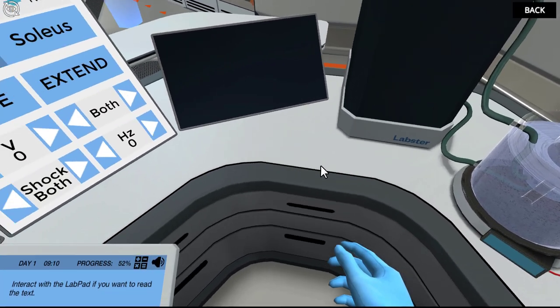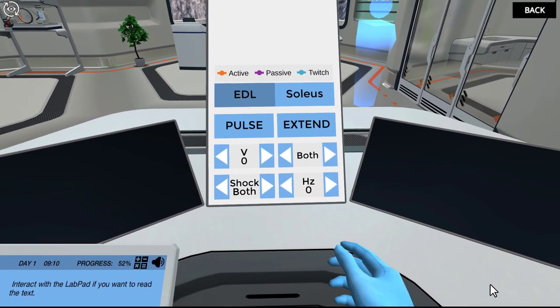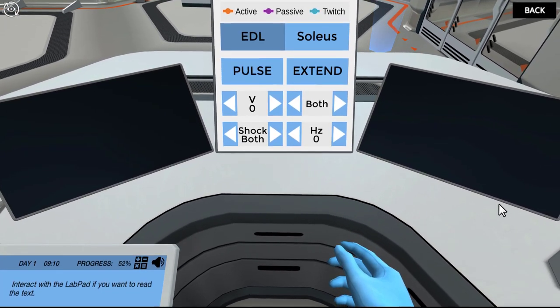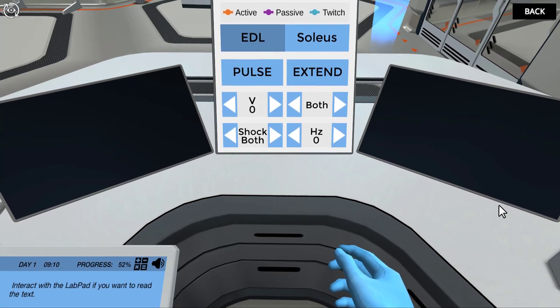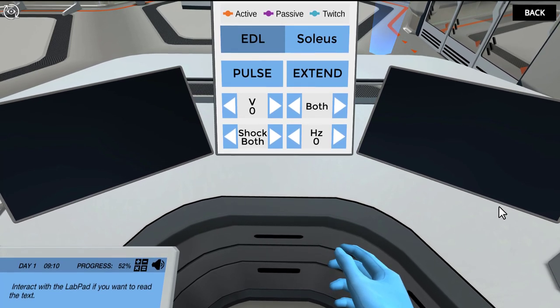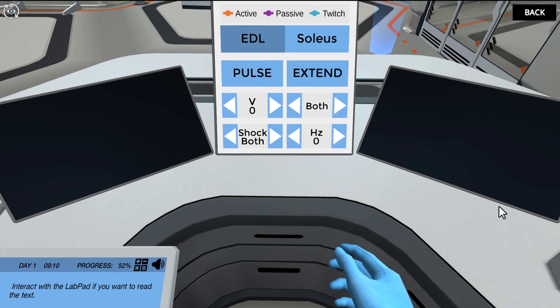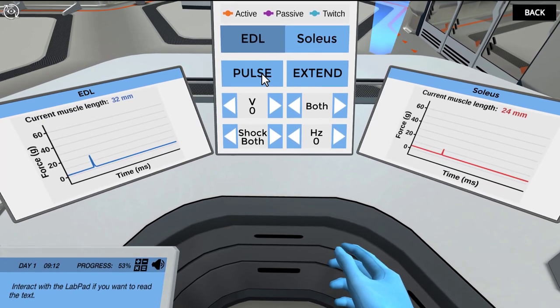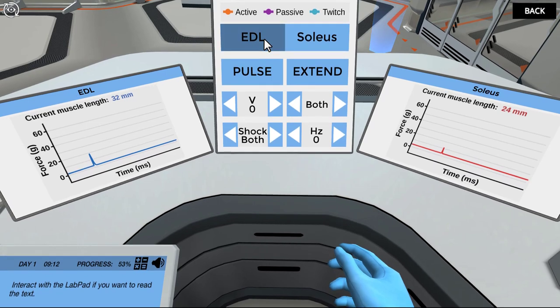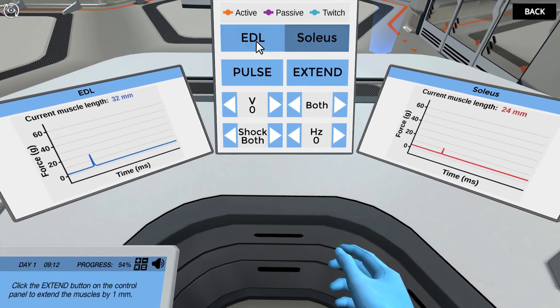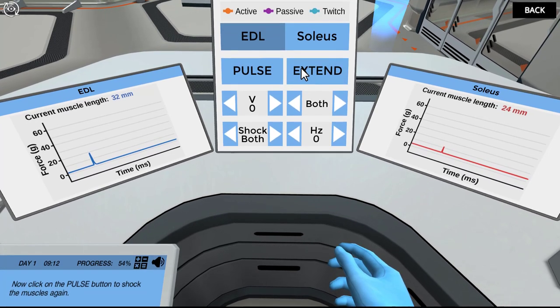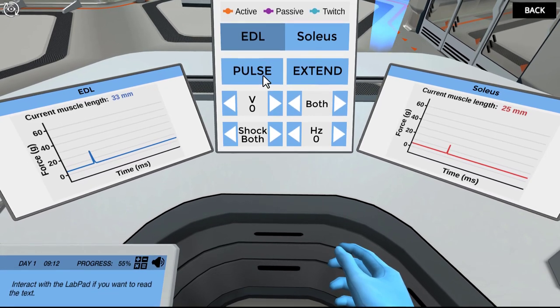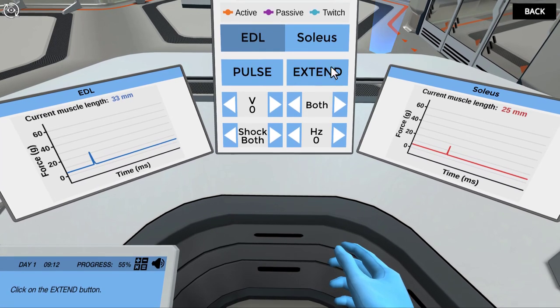On the middle screen, you will find the interface for both force transducers. The data will then be logged on the two peripheral screens. When you stimulate the muscles, the twitches will be recorded on the screen. Then you will stretch the muscle one millimeter and the twitches will be recorded again. You will repeat this until you see a decrease in force. This will help you find the optimal muscle length. Click on the pulse button to shock the muscles. You can click on the EDL and soleus buttons on the control panel to toggle between the data for each. Click the extend button on the control panel to extend the muscles by one millimeter. Now click on the pulse button to shock the muscles again. Seems like stretching the muscles allows for a bit more force to be exerted on them.